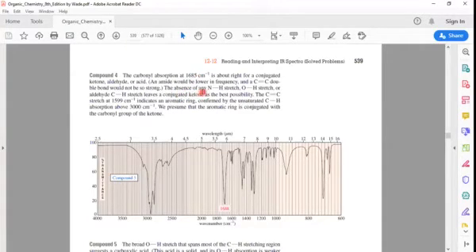The absence of any NH, and the OH group is also not there, and we do not have aldehydic CH stretching either. The carbon-carbon double bond stretch is there at 1599, and that indicates an aromatic ring, confirmed by the unsaturated CH absorption above 3000. So we assume that this is a ketone with conjugation to an aromatic ring.